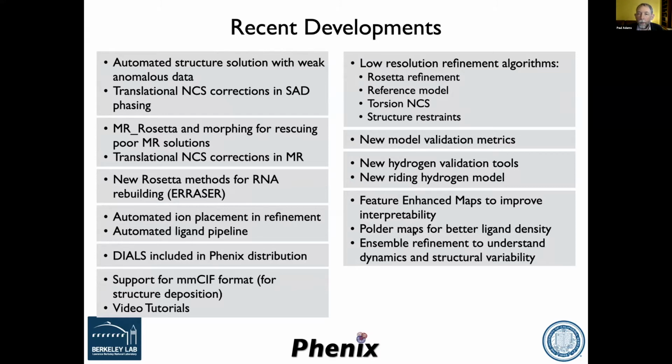So there's always new developments to try and make crystallography better, because even though it's very mature, there are still things that aren't so straightforward. And as I said, things like refinement are not automatic by any means. So there's still a lot left to do.